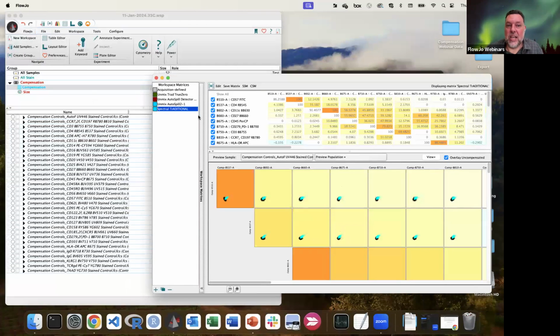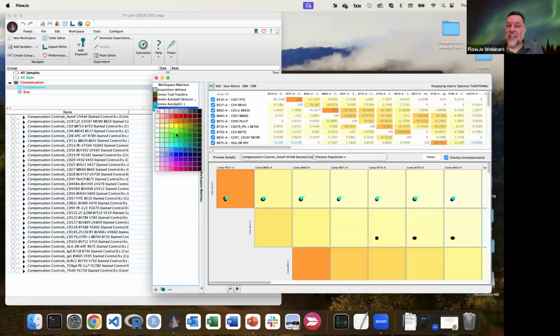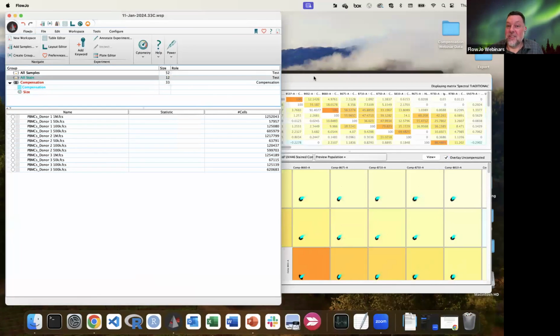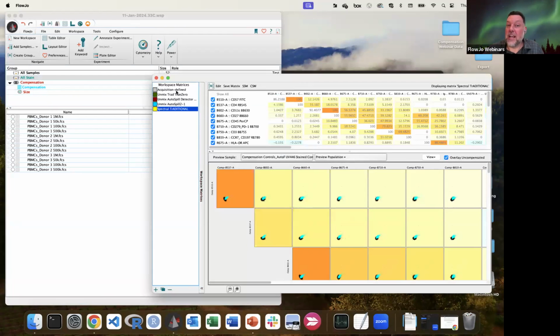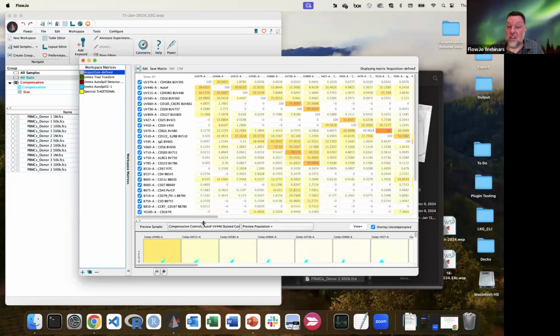So I've done this a couple times on this data set: unmixed using traditional gating with a true zero for the autofluorescence. I can unmix using AutoSpill and linear regression to calculate the slopes and spillover. I can unmix again, and again, and assign different colors and apply these to the data for my all stains, right? So right now it's on the gray acquisition defined matrix, which is this really big spectral matrix from the instrument. Nothing wrong with this matrix.